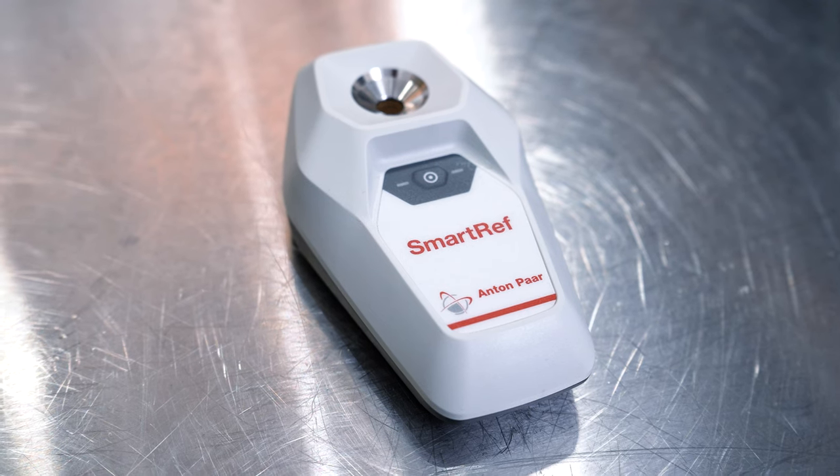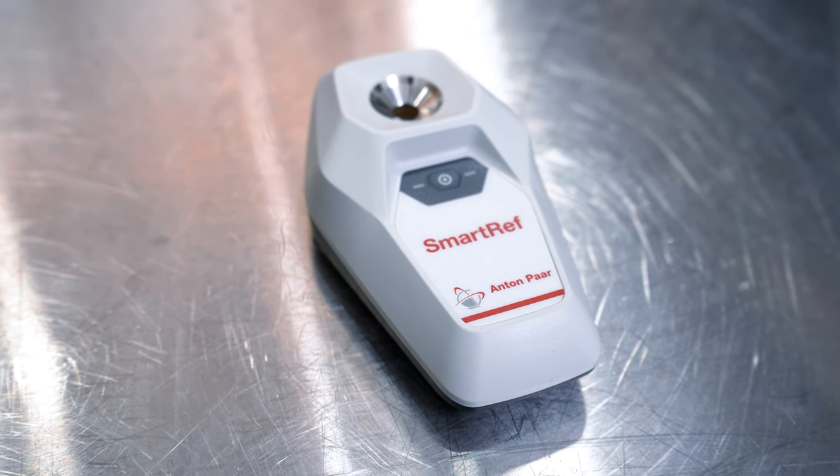The SmartRef Digital Refractometer, also made by Anton Parr, works like a standard refractometer, but unlike standard refractometers, it actually provides accurate numbers without the need for temperature, wort, and alcohol correction because the SmartRef has all these calculations built into it. It can also measure the specific gravity of both unfermented and fermented wort because it has a correction factor built in for beer that contains alcohol. It is less expensive than the EasyDense, although slightly less accurate.